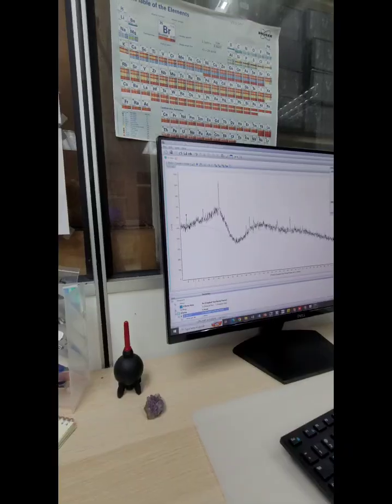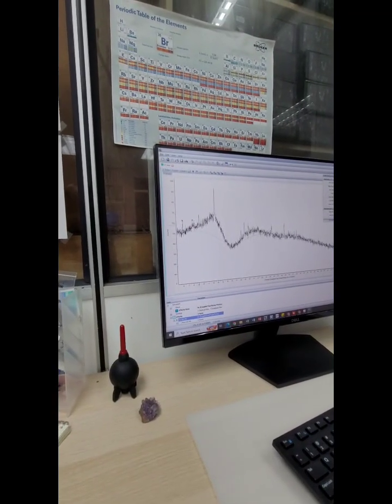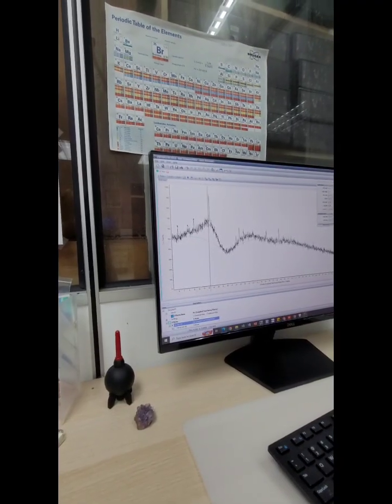We will select the significant peaks to calculate the percentage of crystalline and the percentage of amorphous.